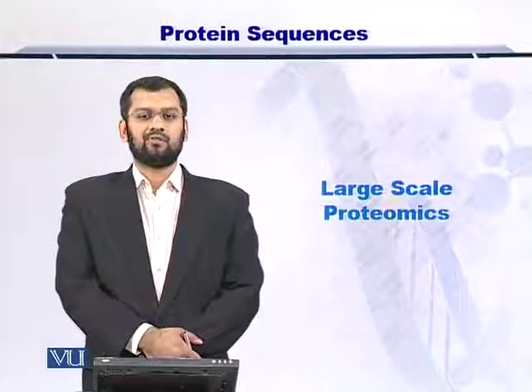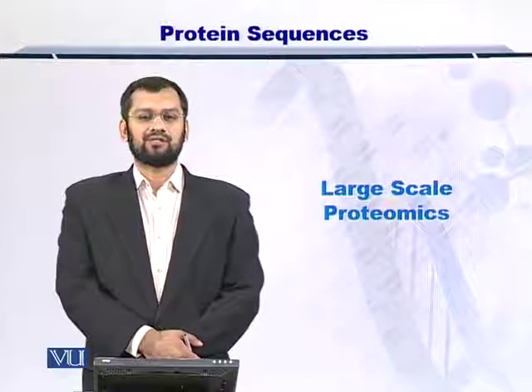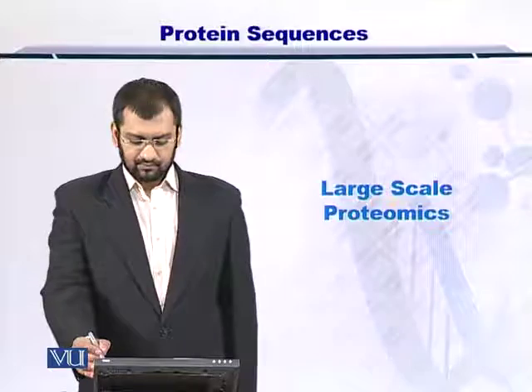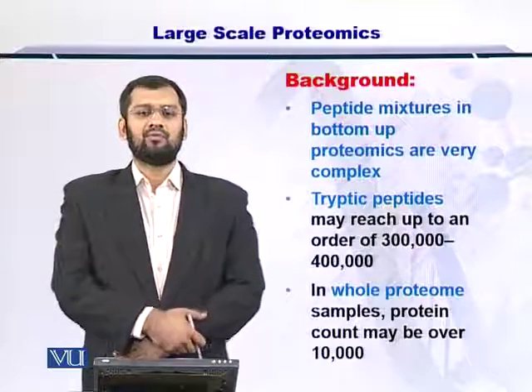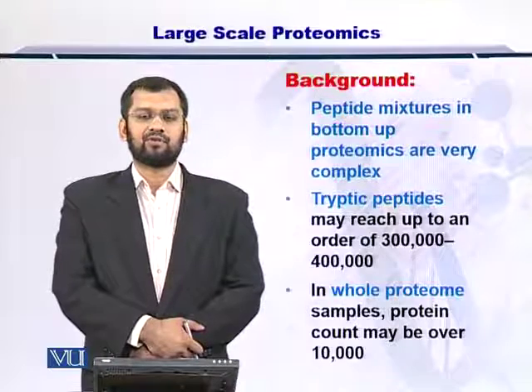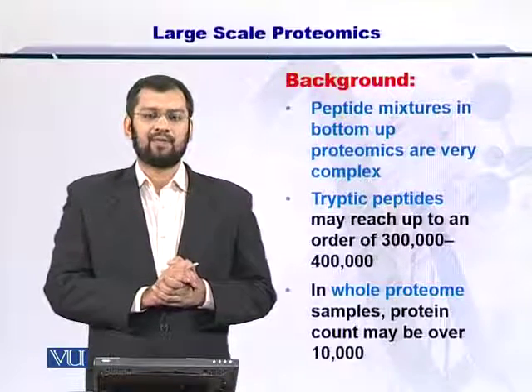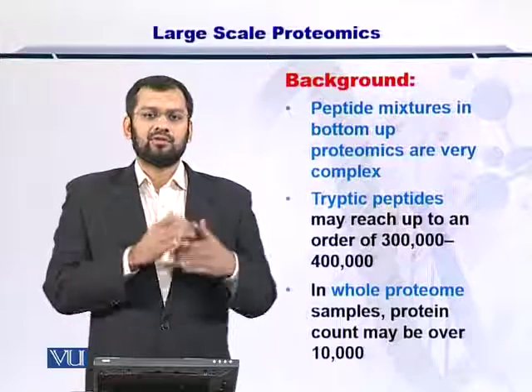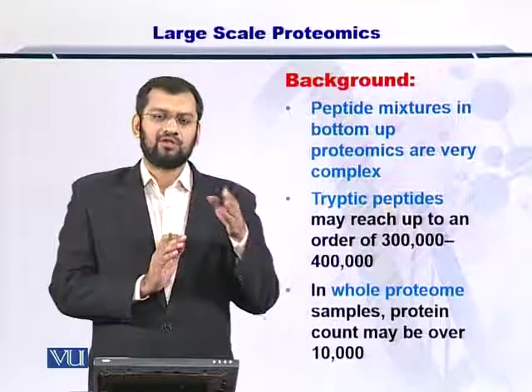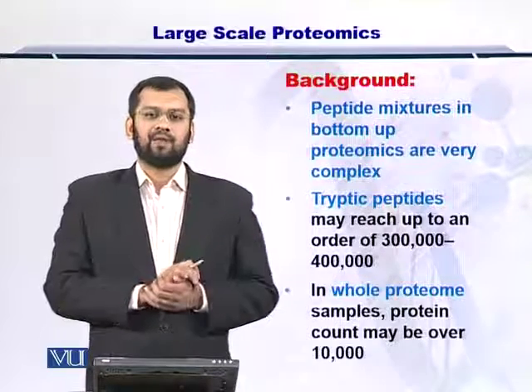Dear students, in this module, we're going to look at large-scale proteomics and its applications in academia and industry. For that, we need to understand that peptides that are injected into the mass spectrometer's chamber are an extremely complex mixture. It contains thousands of peptides, and the mass spectrometer sorts each of these peptides by their molecular weight.